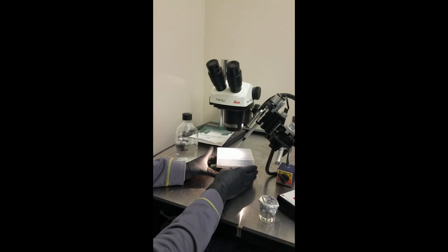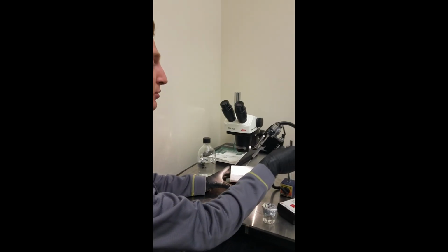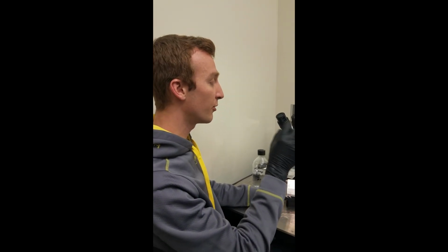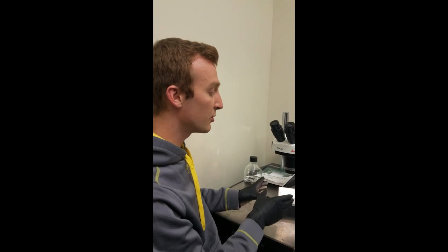One last tip that I forgot to mention is I find it a lot easier when you're doing the injections to move the entire tray up and down to get to the other oocytes rather than trying to move the needle every time. If you can keep your injection needle focused and in the center of the microscope, it's a lot easier just to move the whole base to the next oocyte.